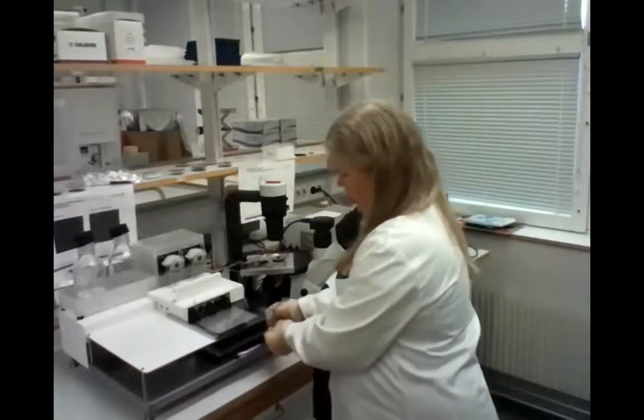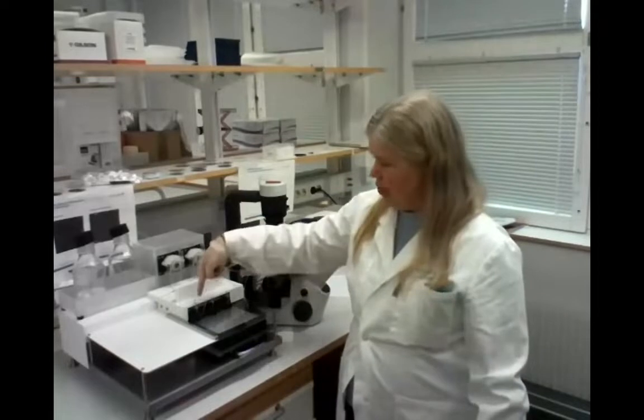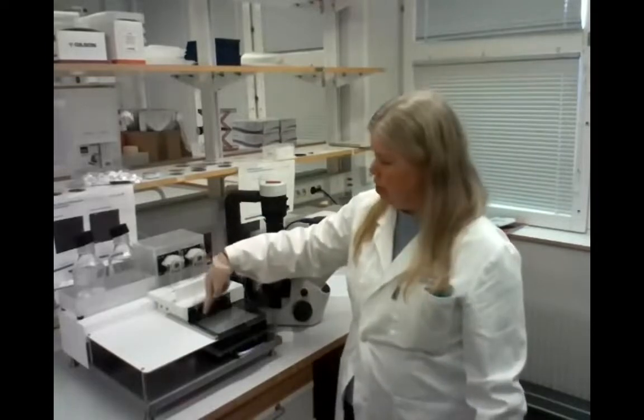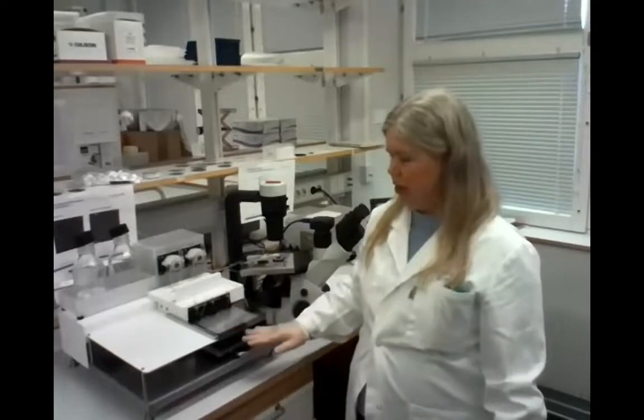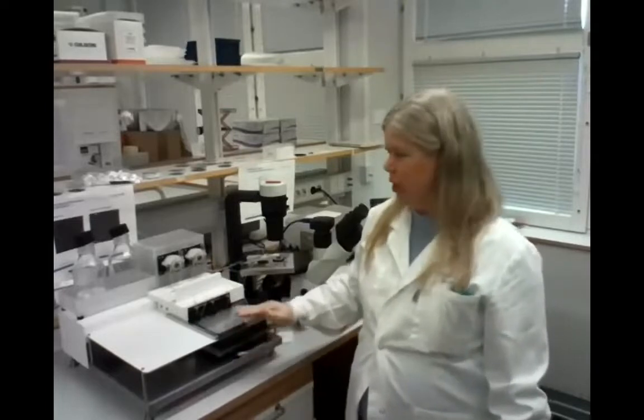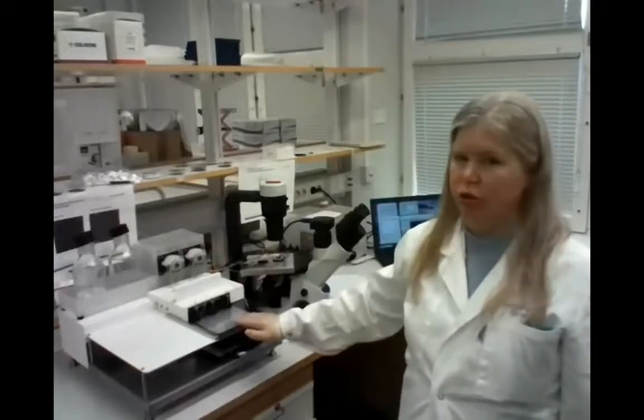So when the sampling happens, you have the tube going up and down within those tubes, and it's moving automatically. The drain volume that you're not sampling is just going to the drain flask here. When you have finished your experiment, you have your perfusate samples here, so you just cap them and put them into the freezer until they are able to be analyzed.